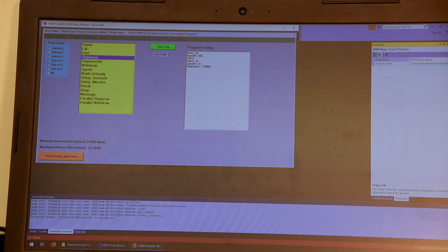We have users, especially for solid phase extractions and for solid phase synthesis, whose programs can get to be thousands of lines of code long. Basically, the Program Builder gives you the freedom to literally string together any syringe pump action into your unique program.